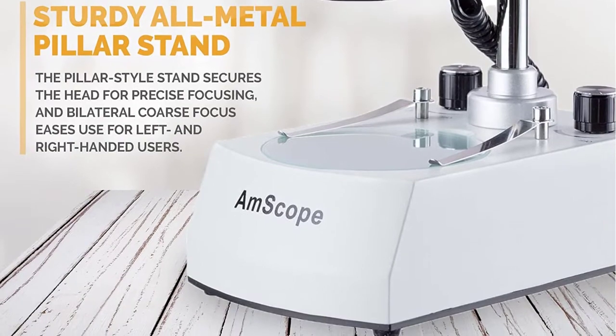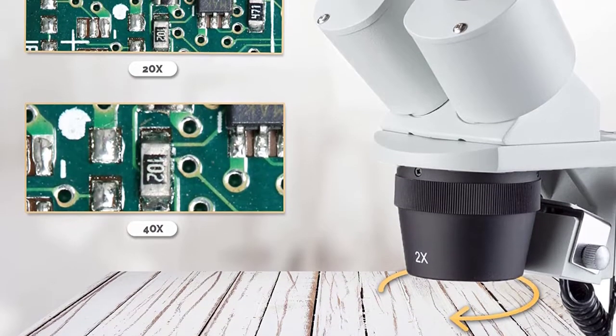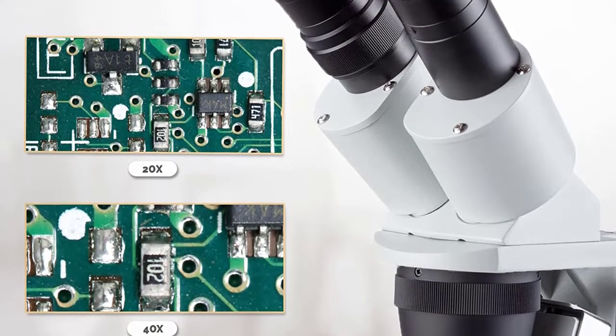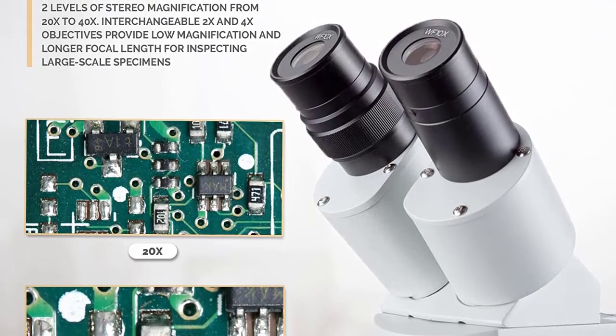Upper and lower illumination with LED light source. Frosted stage plate allows light to pass through from below with transparent specimens. Reversible black and white stage plate provides contrast with light and dark colored specimens, and stage clips secure the specimen during viewing.